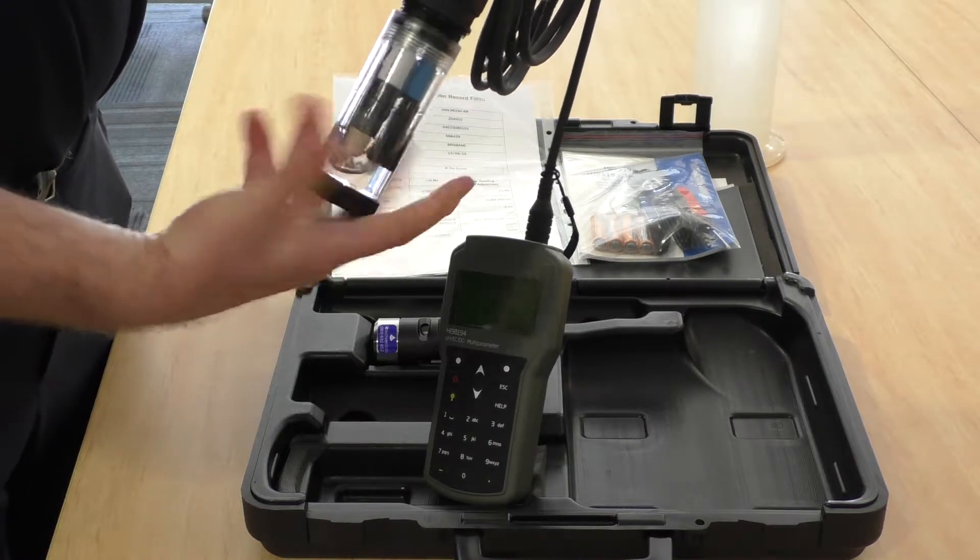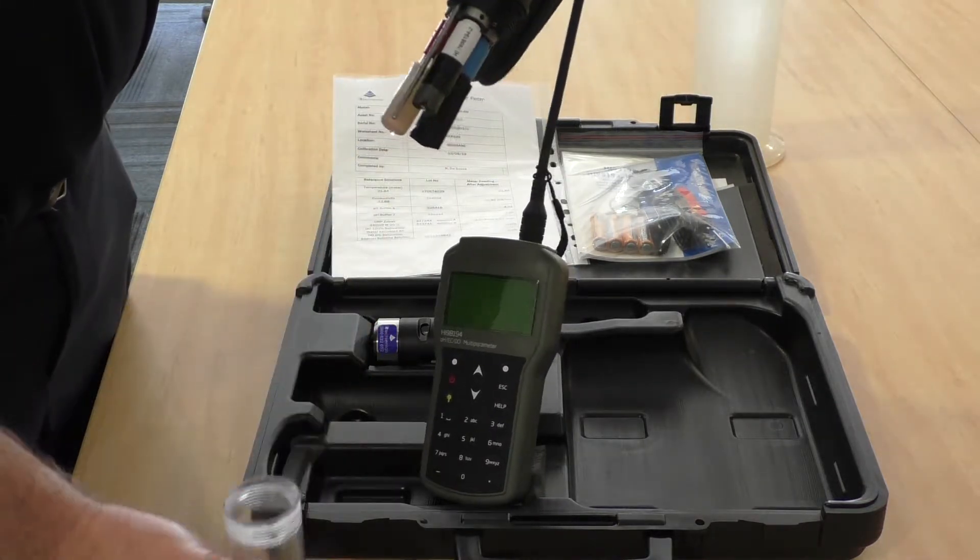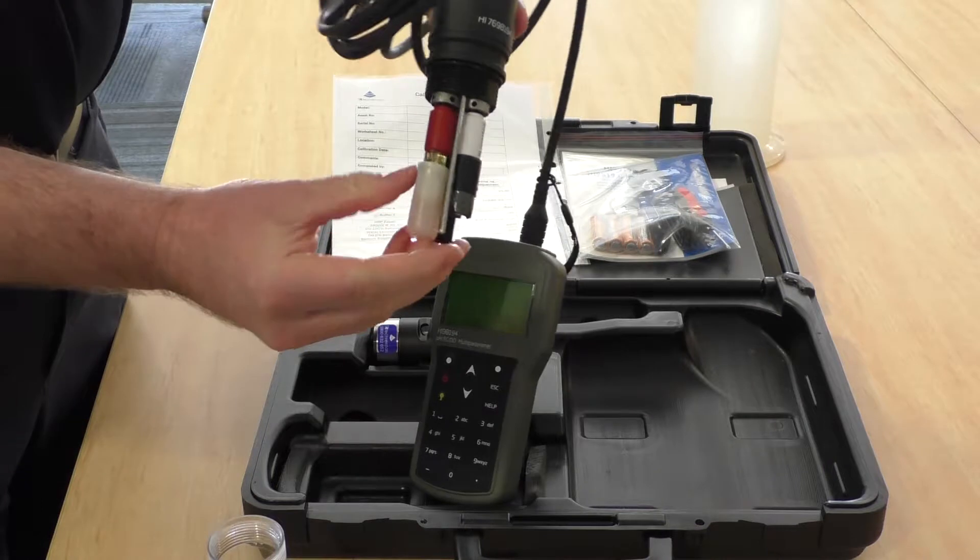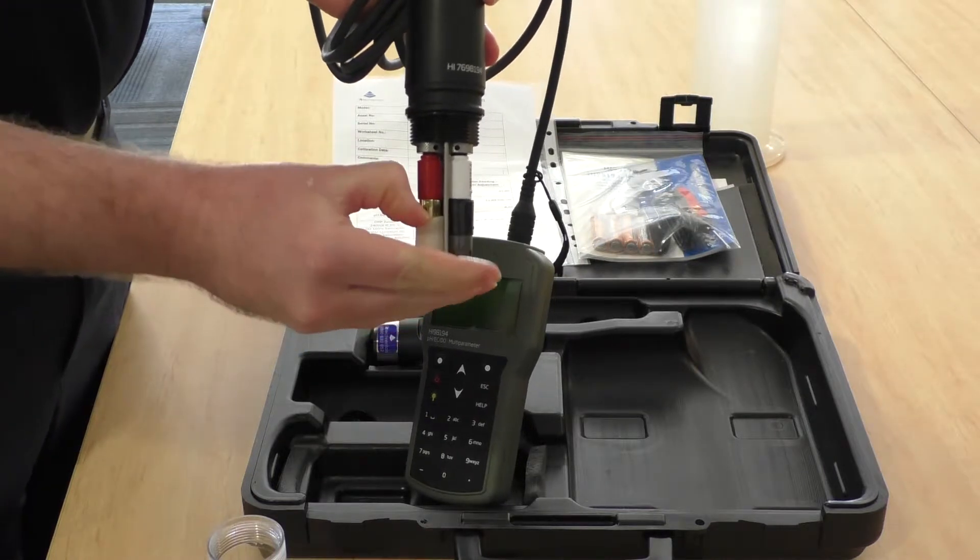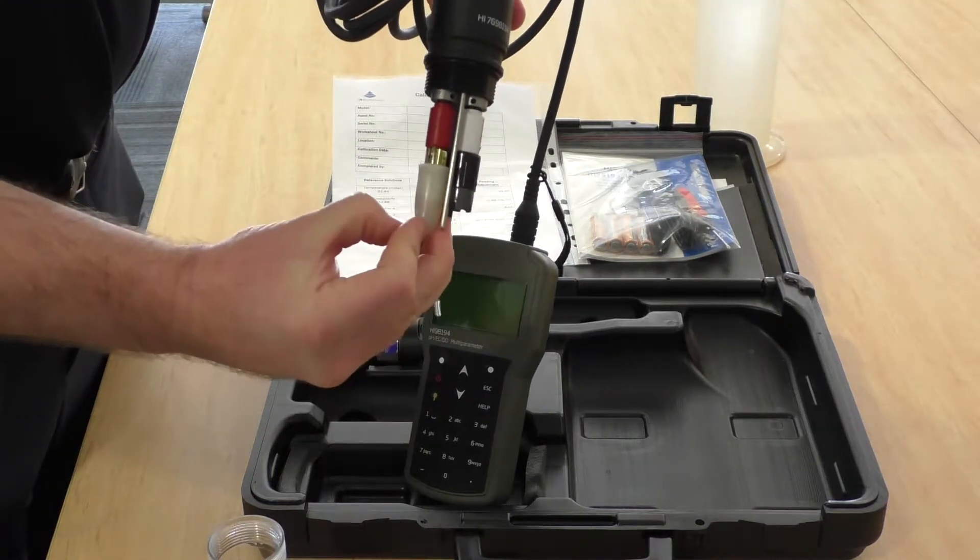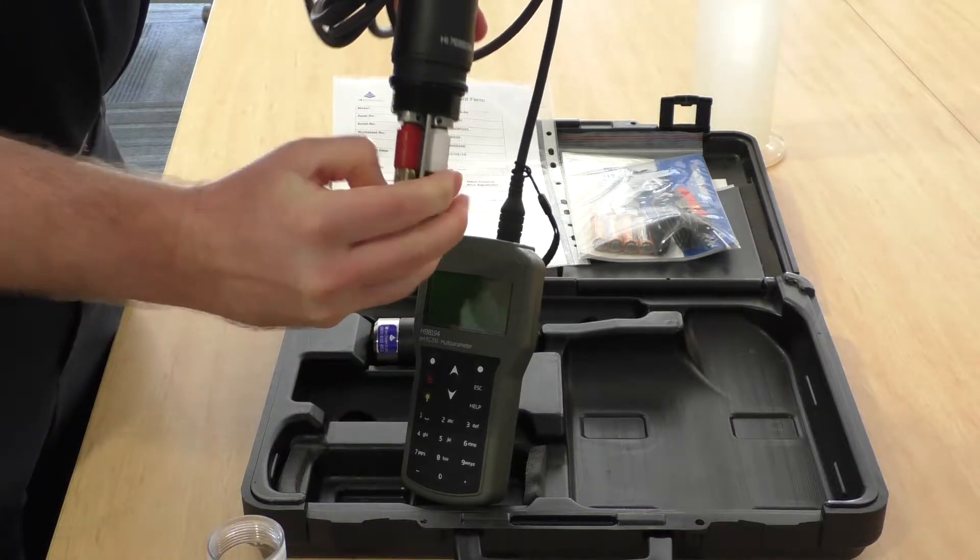If we take that off, we can see the pH sensor has got its own special wetting cap on. The best way to store that is with some pH 4 solution in it.